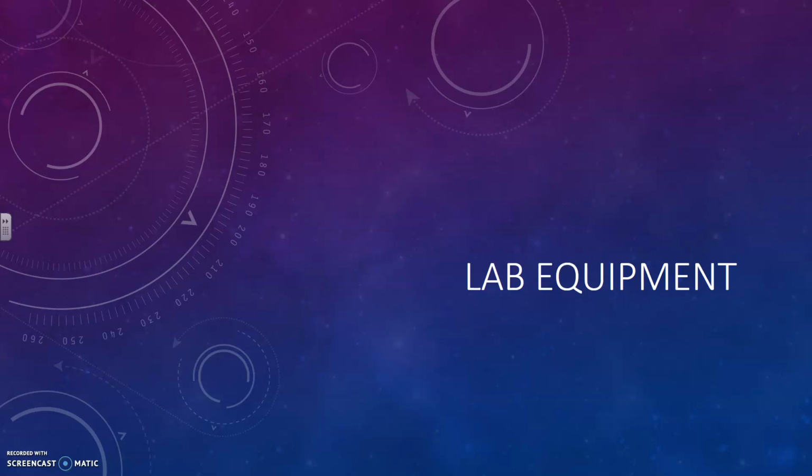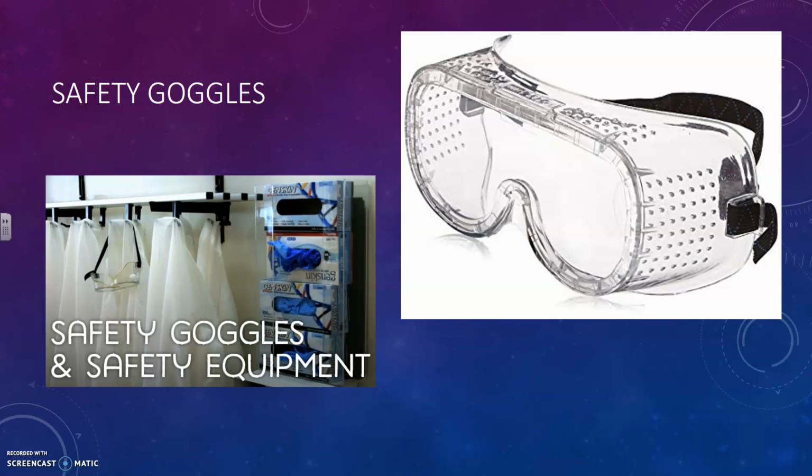In this video, we're going to run through some of the common lab equipment and some uses that you might see for them. So first up, you have your safety goggles. You also have more safety equipment than that, but your safety goggles are pretty standard. They just cover your eyes, and then they have an elastic band that goes around the back of your head. They are there to protect your eyes from any chemical splashing. So they are very important and help keep you from going blind.